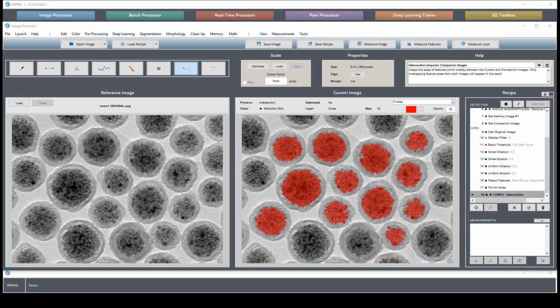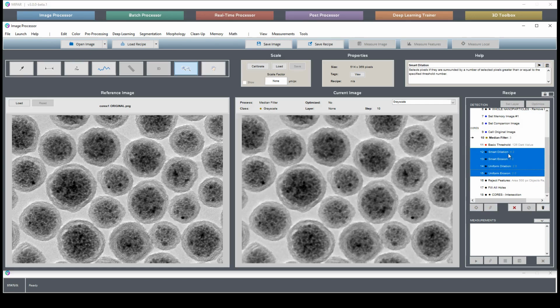It's worth mentioning, though, that these trade-offs are really small trade-offs. A little bit extra or a little bit missing. If we had stuck with our really heavily cleaned image, those trade-offs would have been much bigger. A whole piece selected or a whole piece missing. So the fact that we kept some of this original noise gives us a little bit more leeway when it comes to picking our values for post-processing.